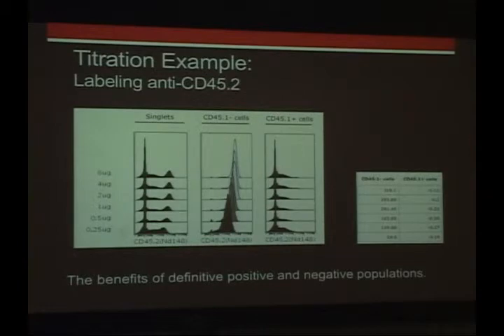So now I'll walk you through a little bit of titration data and just sort of point out some of the things to look for. And as I mentioned, this really applies to fluorescence-based flow cytometry also. So titrating antibodies, as Peter mentioned, and I'm going to repeat because it's really important for phosphoflow, is really critical. A lot of things change when you start staining fixed perm cells rather than live cells. So I really, really strongly recommend doing that before throwing important samples at the machine.